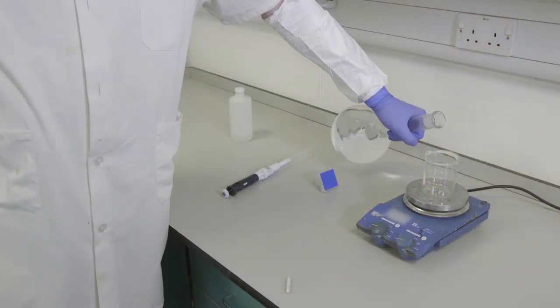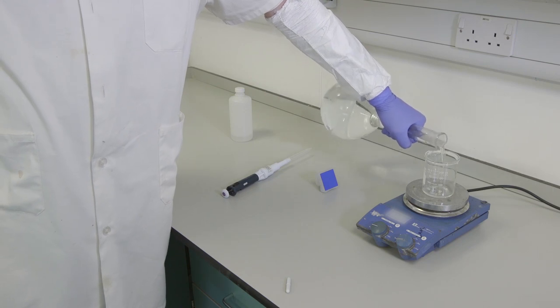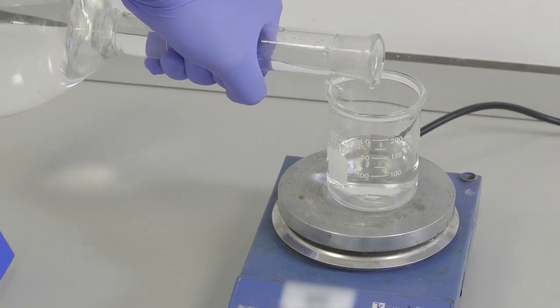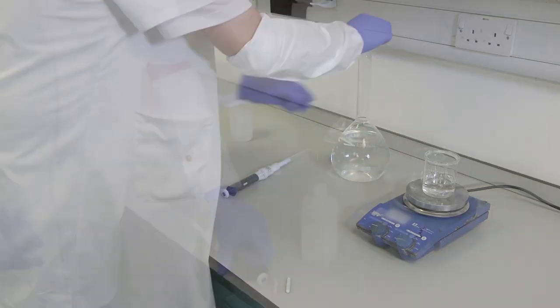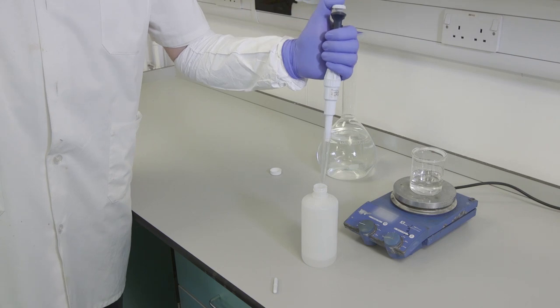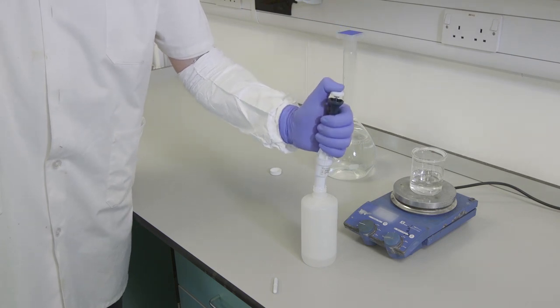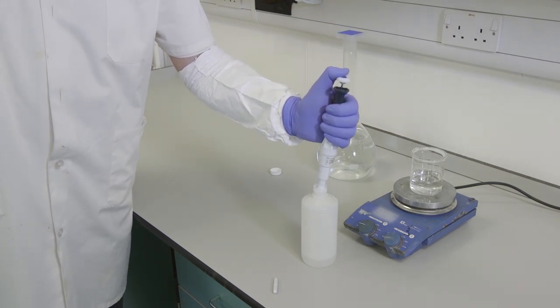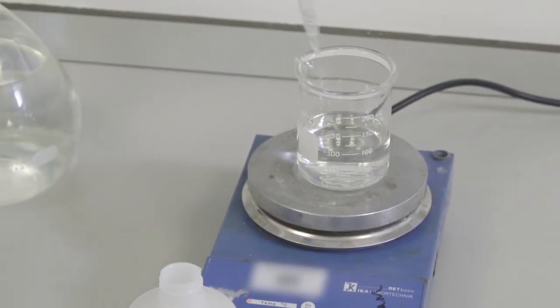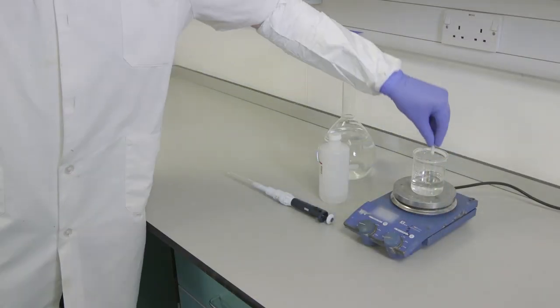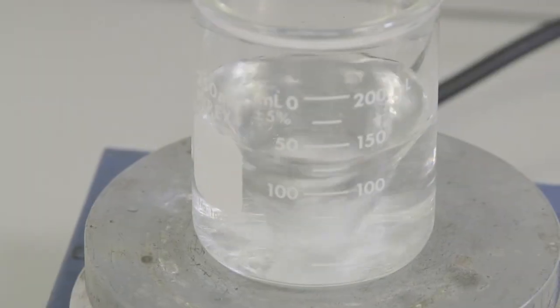Prepare 50 millimolar Tris buffer saline solution and add 1% Triton X100 to a proportion of the solution. Put a magnetic stirrer in the beaker and stir until the Triton has gone into solution.